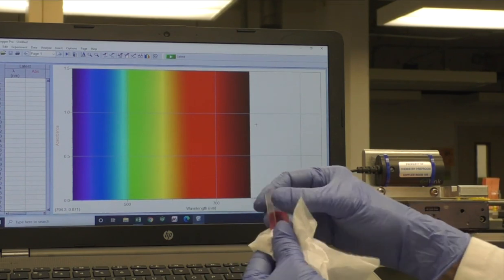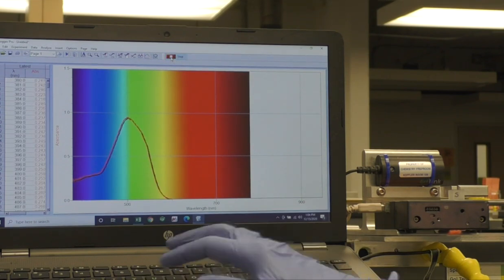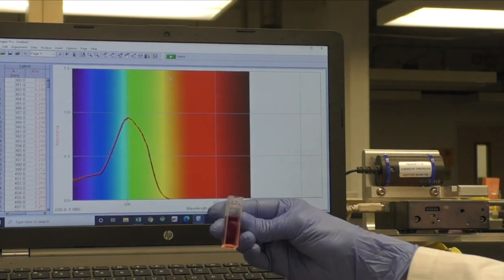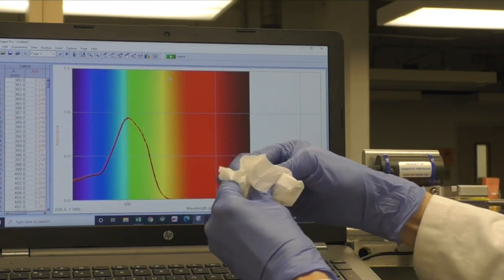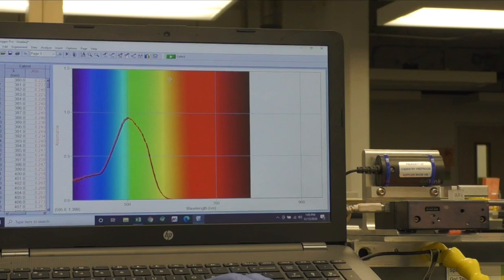Choose the stock solution cuvette, wipe it, place it in the spectrometer, and click the green collect arrow. Wait a few seconds and click Stop. Choose your next solution and repeat the process, being sure to choose Store Latest Run or you'll lose your former data. Repeat this until you have a reading for each of your solutions.